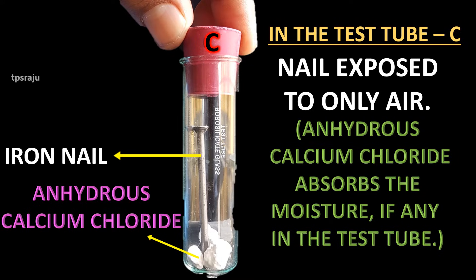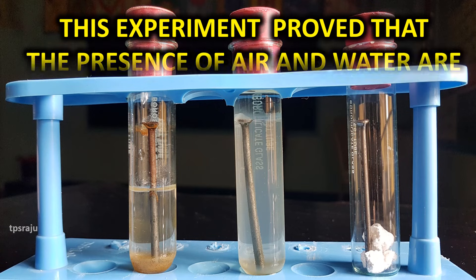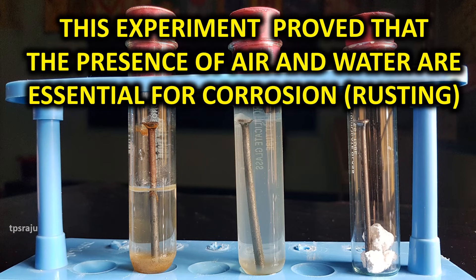In test tube C, the nail is exposed to only air, and there is no water in the test tube. So this experiment proved that the presence of both air and water are essential for corrosion.